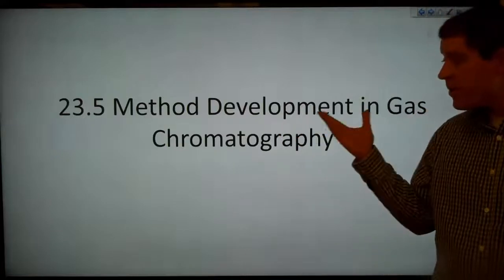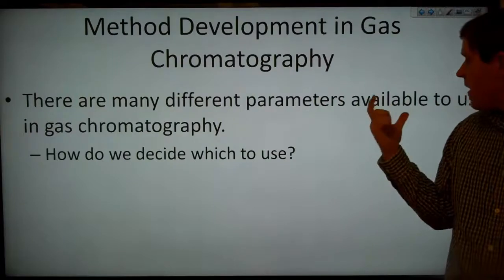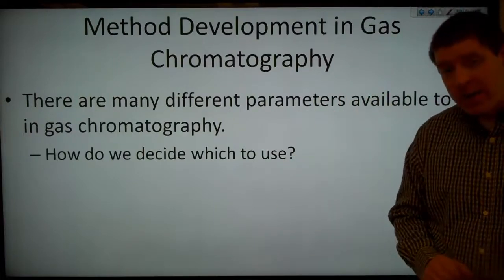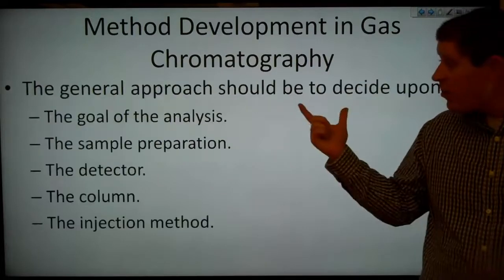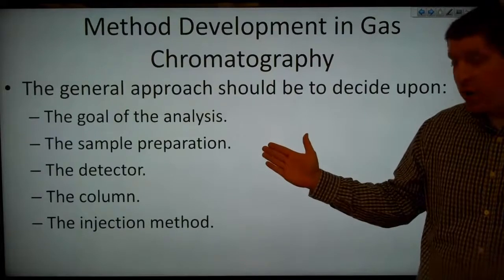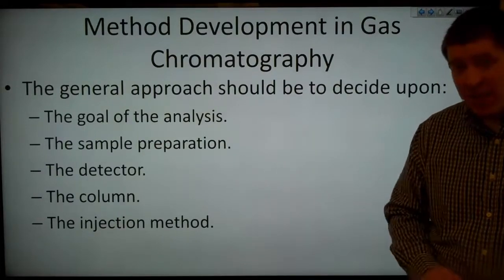Welcome to Method Development in Gas Chromatography. So there are many different parameters available to us in gas chromatography. So how do we decide which to use? The general approach should be to decide upon the goal of the analysis, and then the sample preparation, and then the detector, and then the column, and then the injection method.